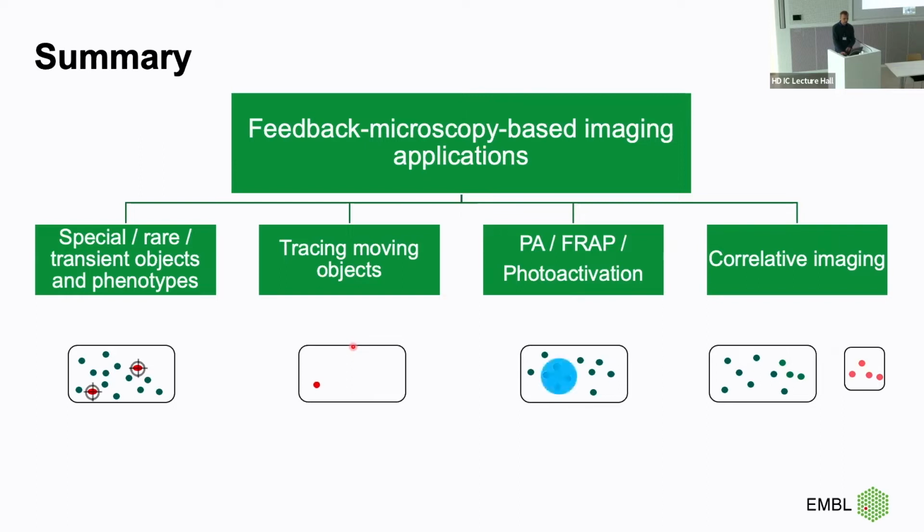We have different experiments. We have FRAP, photoactivation, photoablation, and so on, and we need the respective functionality to be available from both the hardware and software point of view. And again, in these cases, we not only want to control the coordinates of our stage and imaging modalities, but also want to control the regions which have to be photoactivated, ablated, and so on, depending on our analysis. And last but not least, of course, we also have correlative imaging, right?